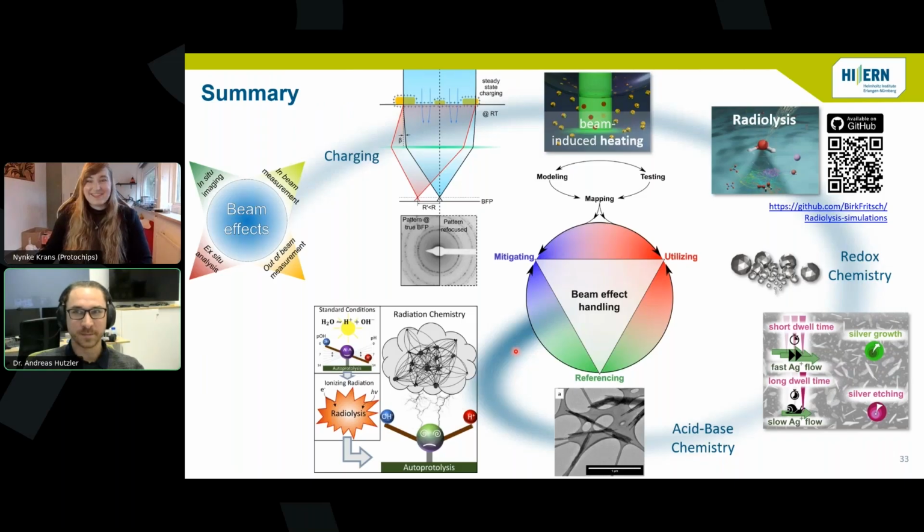So in our experiment, I would not expect a single electron to get stuck in the liquid. So I guess every electron is being transmitted, maybe apart from those which are somehow scattered elastically towards the liquid cell encapsulation or so. So these solvated electrons that we are considering, they are not primary electrons. They are, so to say, fragments of the water molecules.